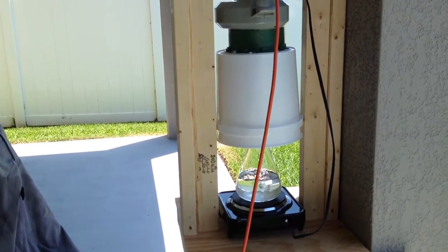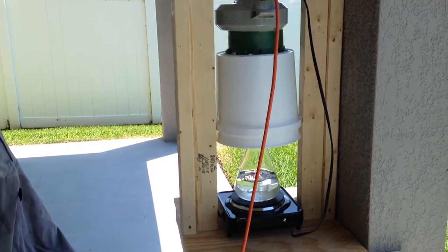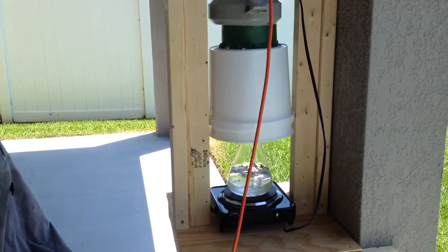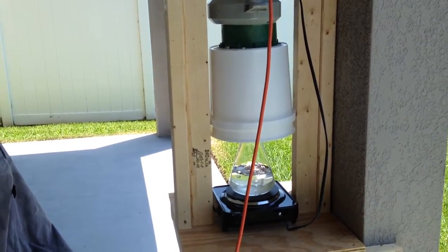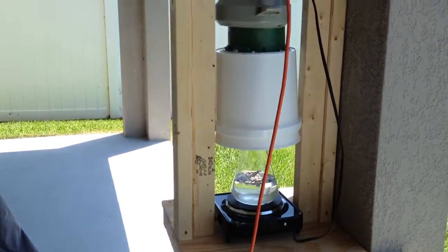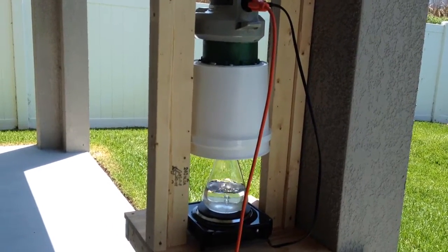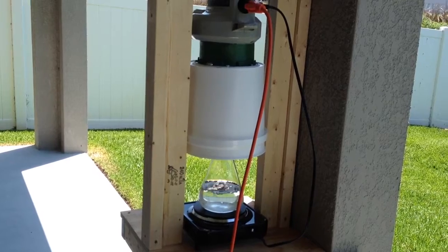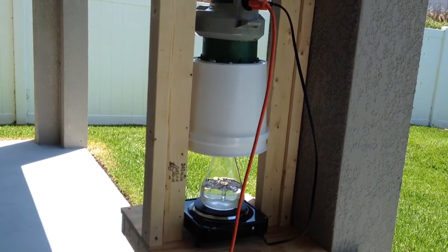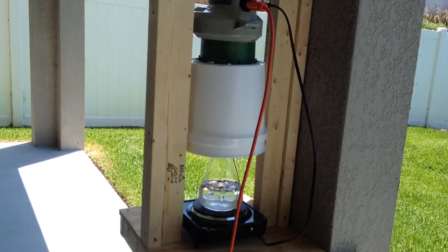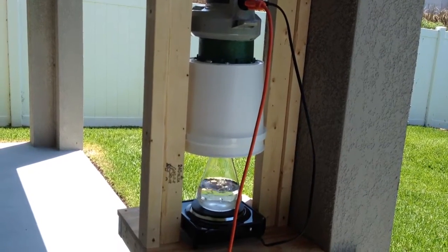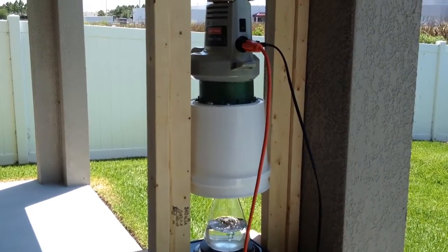I'm preparing to refine some silver at my house as a hobby. I've been researching it for about the last six months and understand to the point where I want to take precautions when I use nitric acid because of the fumes that it produces. Apparently they're very toxic and I've read repeatedly that you're supposed to be doing this outside or using a fume hood, so I decided I'm going to do both.